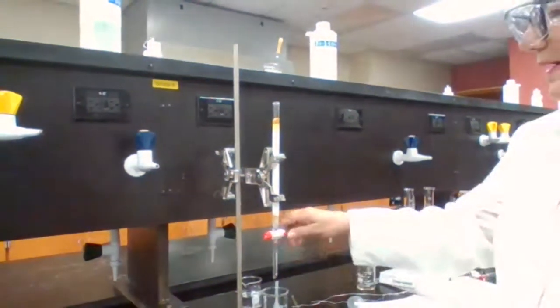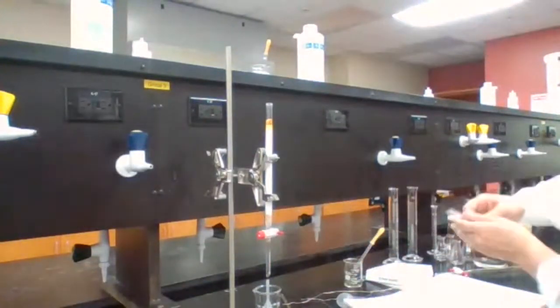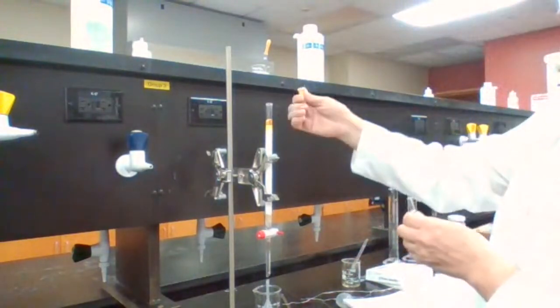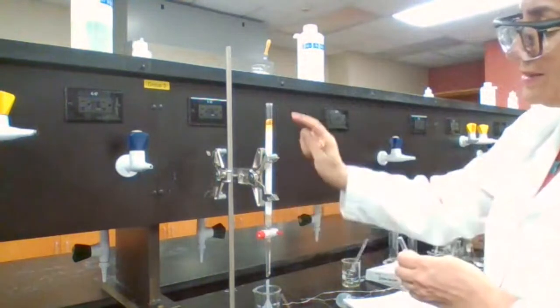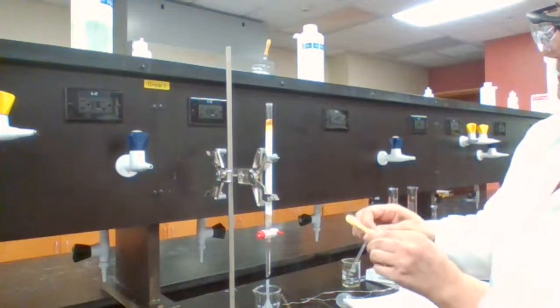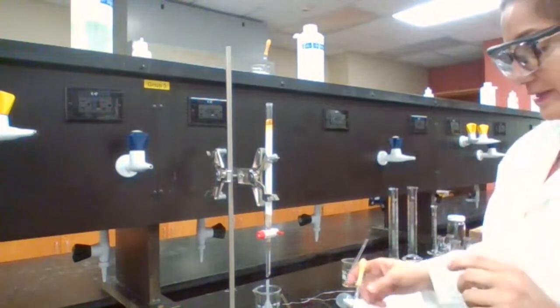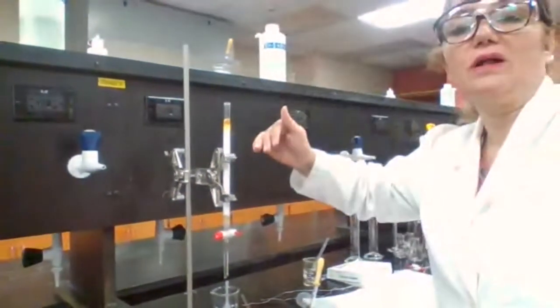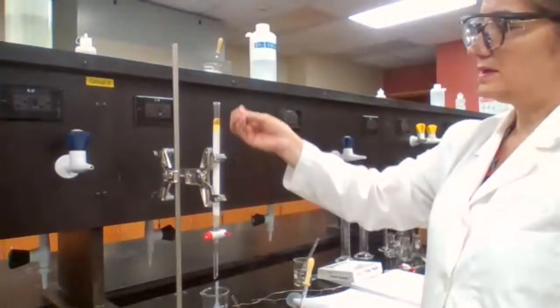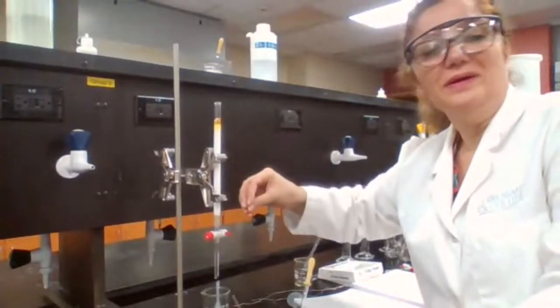Okay, now I have to start the elution process, and to elute, I'm adding solvent from the top of the sample, and I drain the solvent slowly. I'm eluting the solvent. What is happening first is my non-polar solvent. The non-polar solvent is going to dissolve and, as the solvent is coming down, bring the non-polar compound with it down.